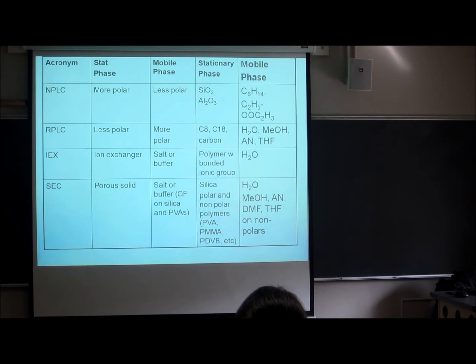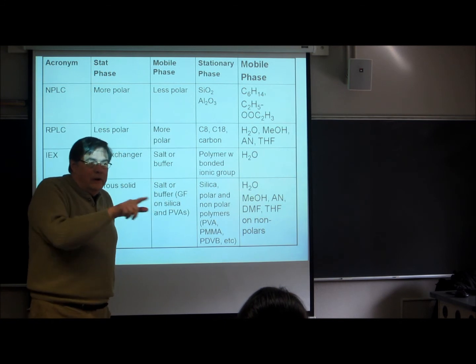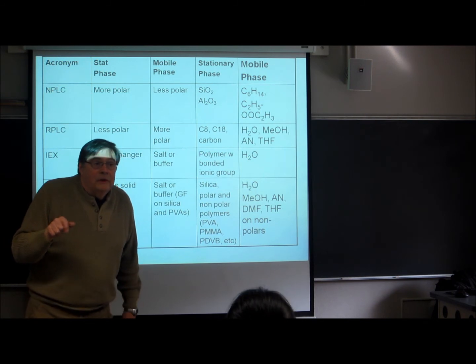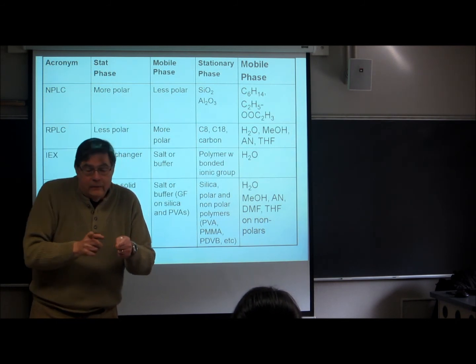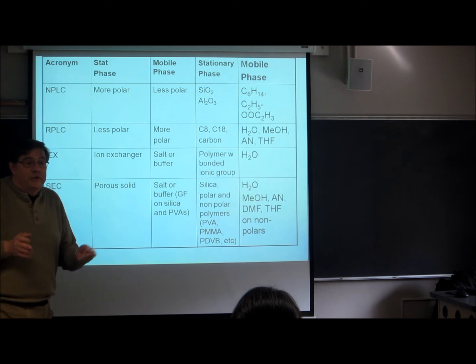If you go around and look at gas chromatographs around the university here, I'll bet 99.5% of them are connected to helium gas. Fine gas, wonderful. A little bit pricey now, but the mobile phase is always helium. So how do you change the separating power of the GC experiment? Temperature. Yeah, program temperature, right. And if that doesn't do it, you can take some close peaks at the beginning and run them cooler and then ramp up to get the later ones to move down, right, to save yourself time. So temperature is your variable there.